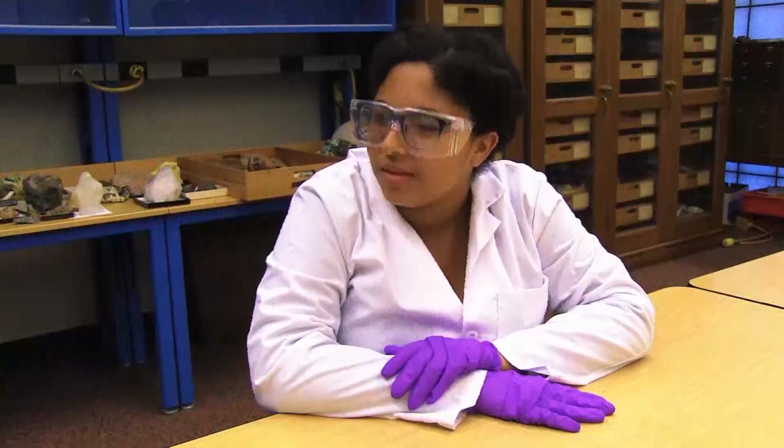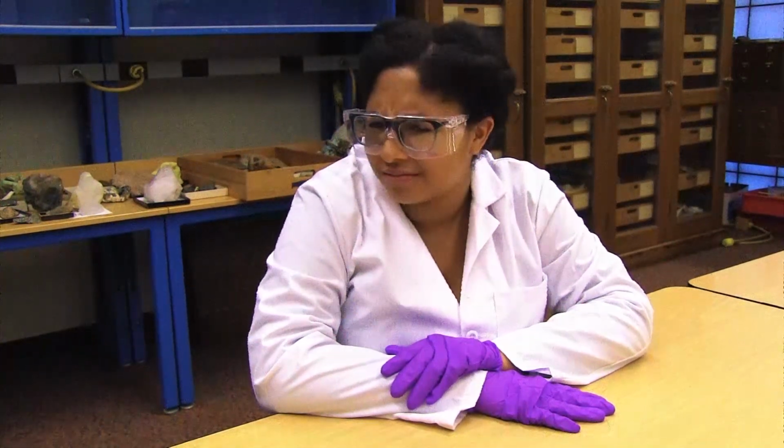Well, she's at real risk for chemical burns from the caustic substance and the acid. Or a burn from the heat of the hot plate. Or the boiling solution itself. Right. I don't really get how the glassware is an issue besides getting burned. Well, if she drops it, then there will be shards of glass everywhere, and she could cut herself. That makes sense. But if she cuts herself on the glassware that's covered in solution, won't she accidentally have it injected into her body? I mean, I suppose so, technically speaking.